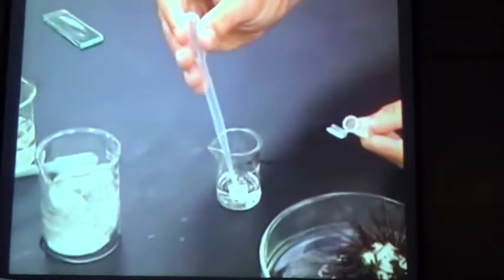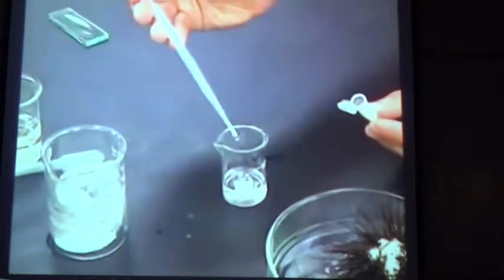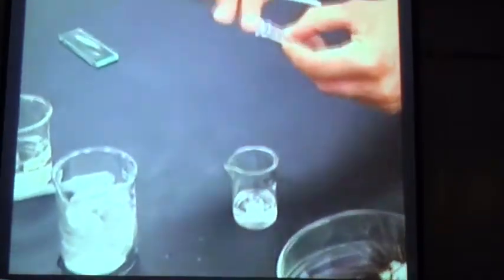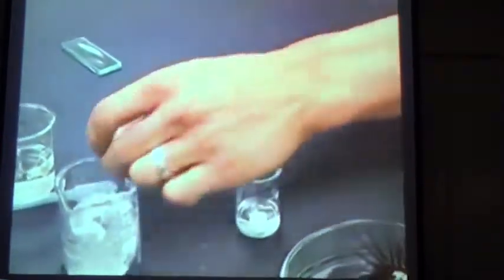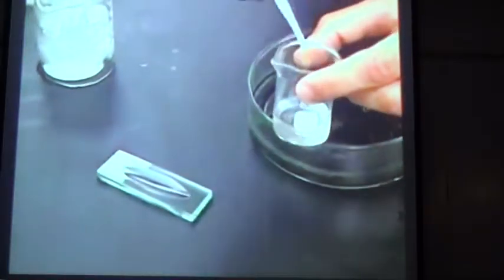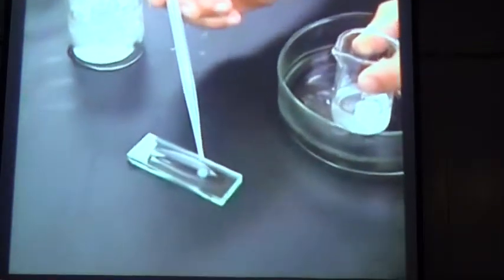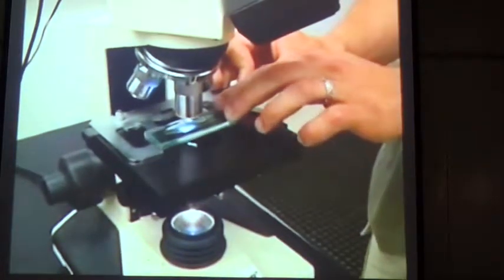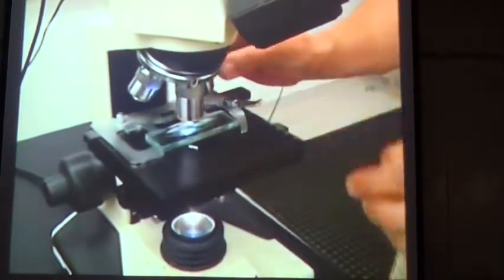Now dilute the sperm in seawater by placing two drops of sperm and 10 milliliters of seawater in a small beaker. Place one drop of the sperm solution onto your depression slide containing the eggs. You can now view the fertilization process under the microscope.